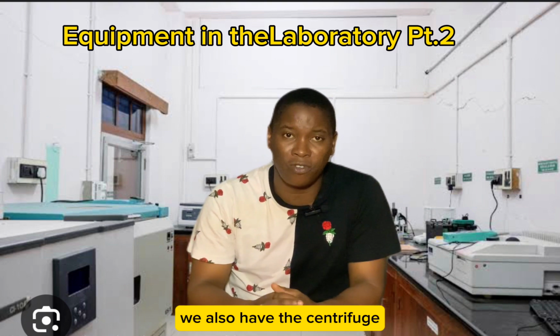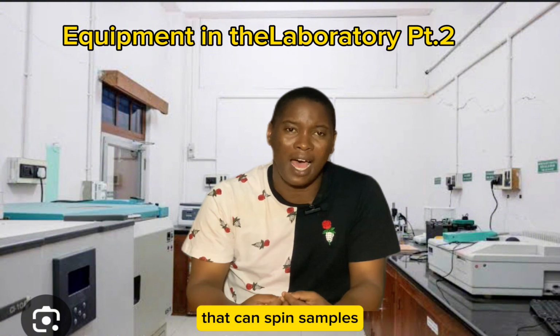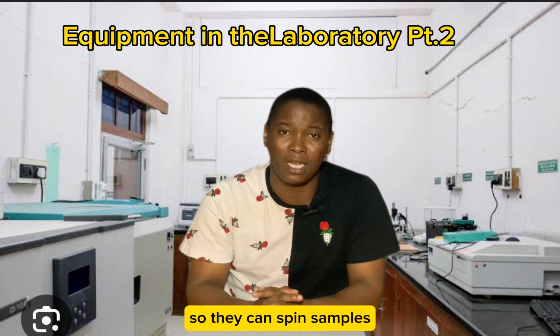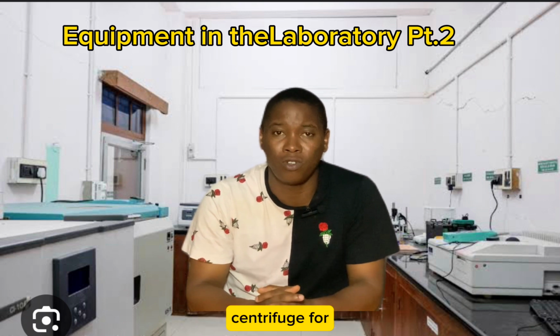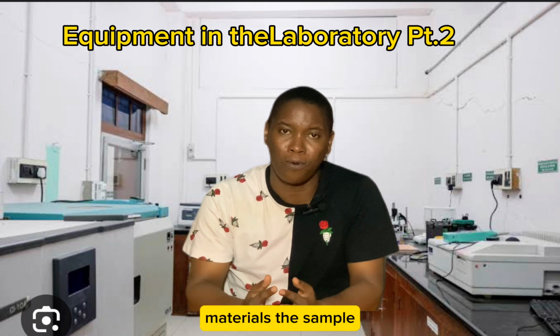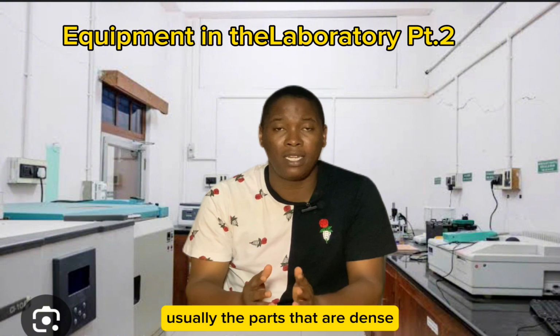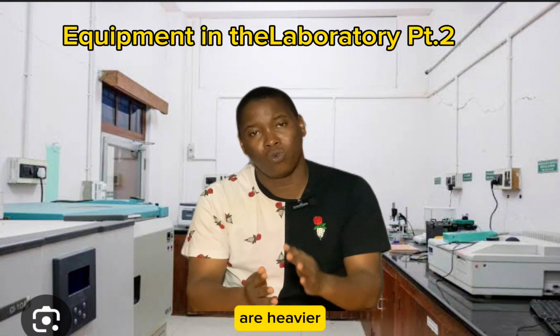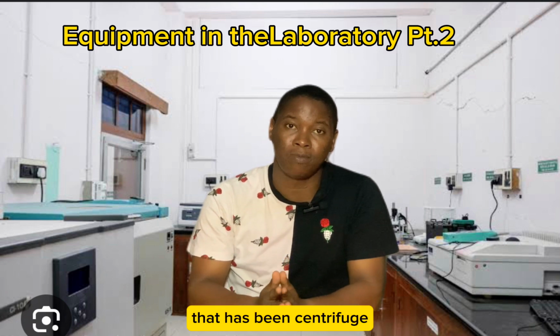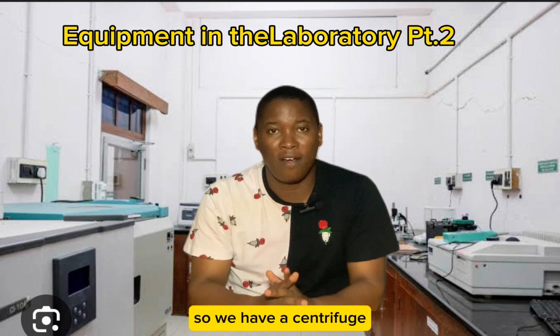We also have the centrifuge. Centrifuges are popular. They are machines that can spin samples at very high speeds. And what do we use a centrifuge for? We use a centrifuge to bring about separation in materials. If we want to separate a sample into its component parts, usually the parts that are denser, heavier, will settle down at the base of the sample that has been centrifuged, and the lighter parts will be at the top. So we have a centrifuge.